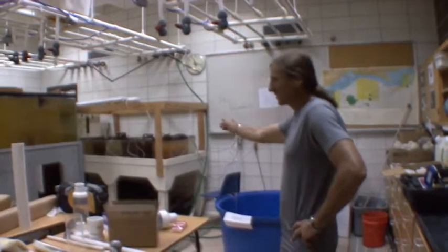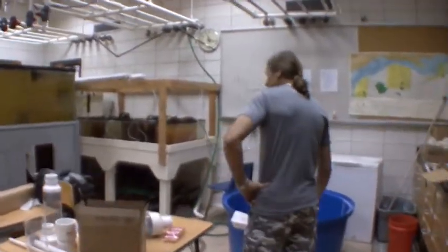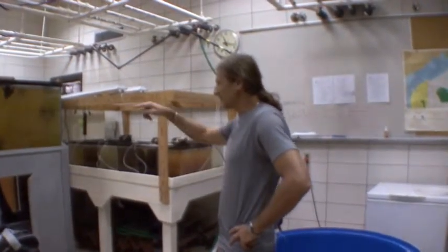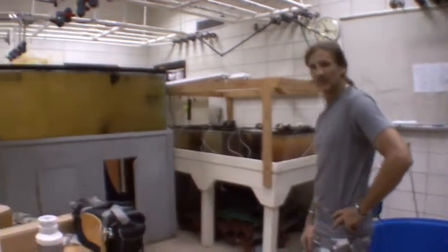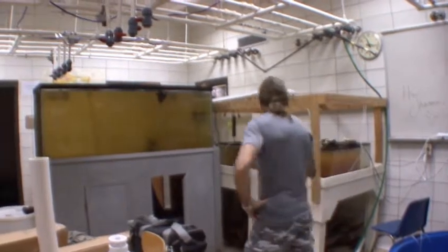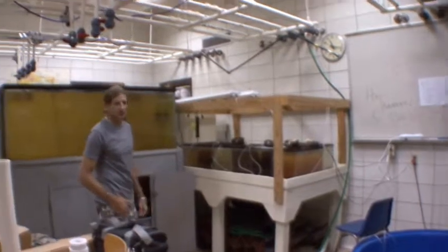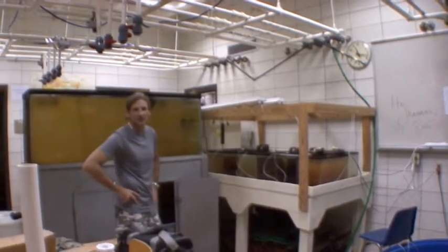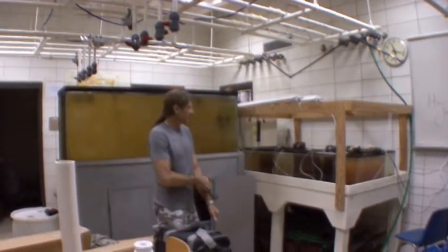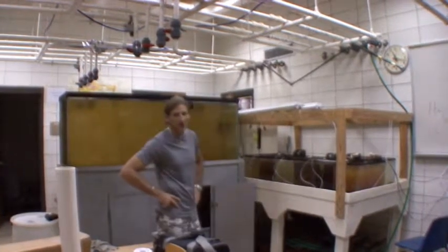As you'll see, we've got some aquariums set up that I put some coral in Saturday. We got some coral that I harvested off the offshore platforms, and we loaded them up in these aquariums, and they were pretty clear. And as you see now, they of course are fouled up, and I believe it's from the oil that they ingested when they were living underneath the platform, and the dispersed oil plume came through, and this is what these guys are feeding on. And so that's what we're setting out here to prove.